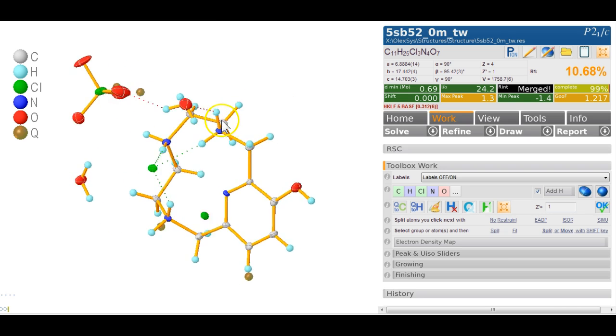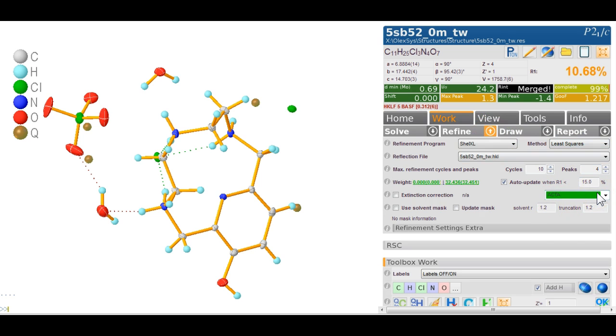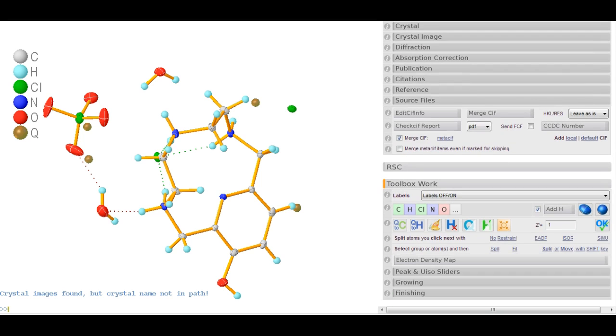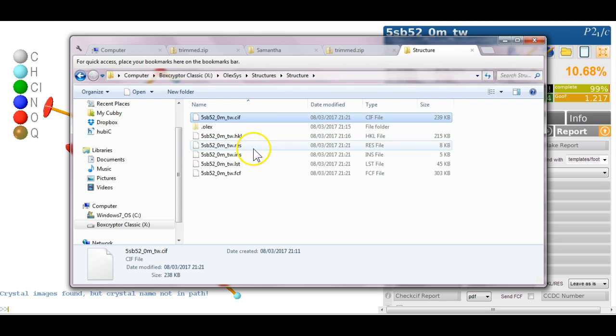So the charge balance is now given and we have learned how to carry on a refinement from a combined CIF file. Now, if I look into this area here, we have the ACTOR on, so that means we are writing a CIF file every time we go. Just to make sure we've done the right thing, we click on the report and we leave the HKL and RES as it is. So this is a SHELX refinement and that means that this SHELX refinement will embed the HKL data in the SHELX format. So the CIF file that we've got here in the outside here, the CIF file here has been updated. The timestamp is correct and the size is correct. This is a new updated CIF file which contains all the same information, including the HKL. So this is the only thing you need to send somebody, because that file now contains everything there is to know about this structure.